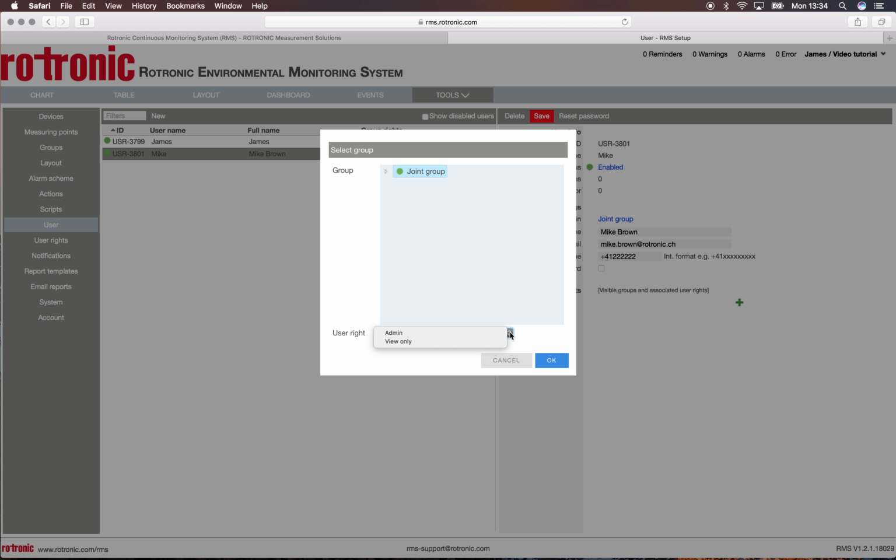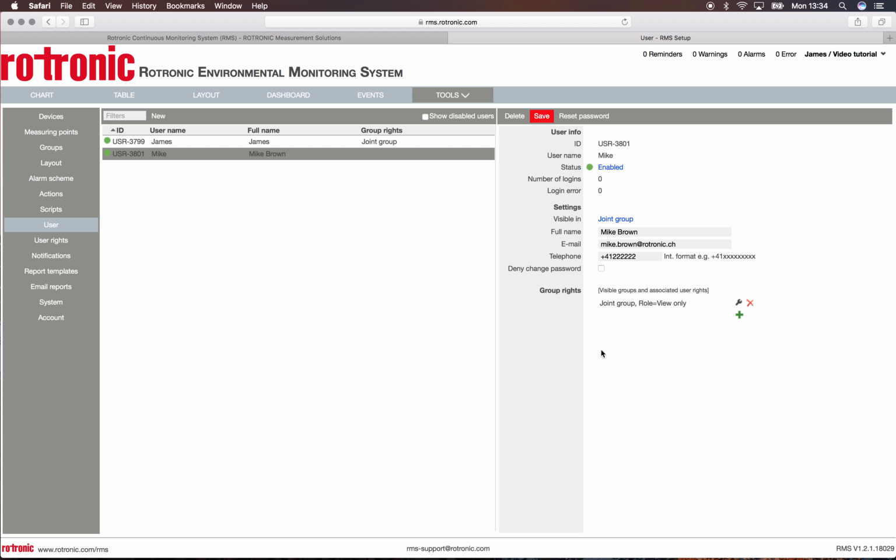Please see the video about creating user rights to find out more about setting the user rights. Then, once the user rights are selected, click on OK and don't forget to save. There you have it, your new user is created.